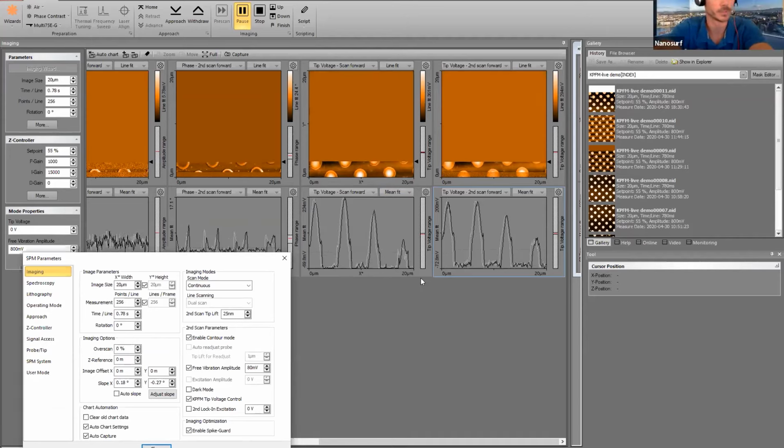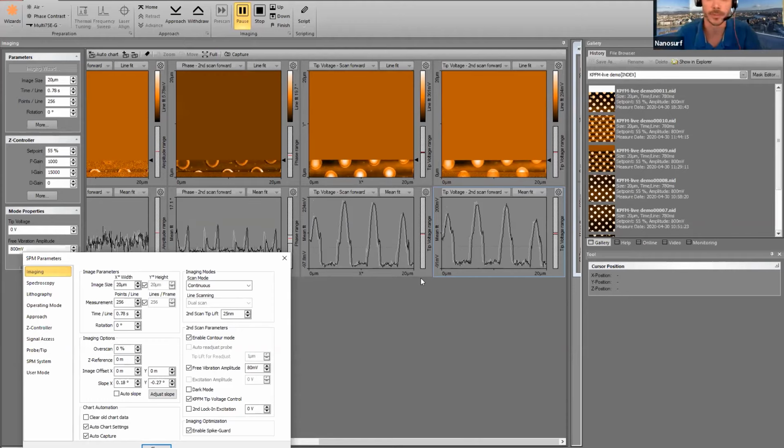Right, thank you, Patrick. That was a cool presentation, very interesting. Not the simplest mode, in my opinion, but it seems that the software does help quite a lot with automatic functions and if you can load the parameter files. Which brings me to the first question: can you send me, or can I have, a parameter file for KPFM? Yes, of course.